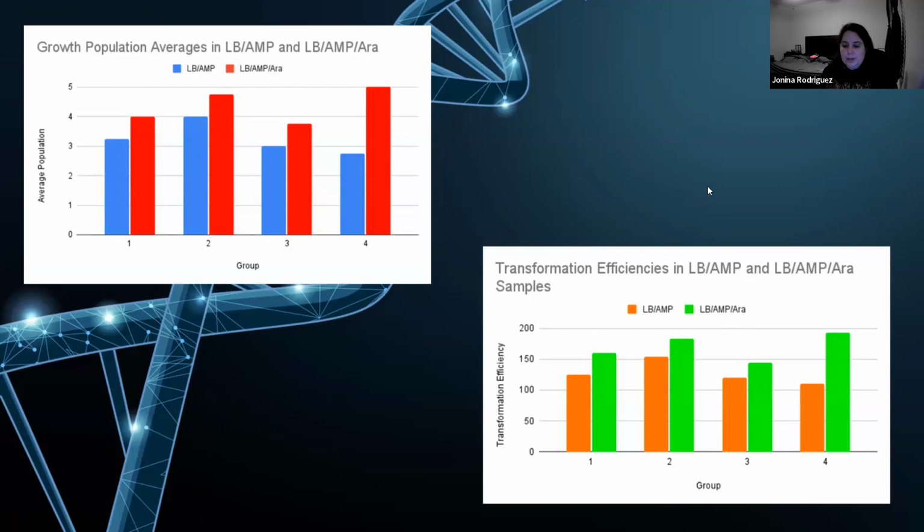So I really enjoyed doing this one because it was very interesting to see how bacteria develops within certain parameters, such as having the pGLO or having the ampicillin and the arabinose in them. I would definitely love to do more of this technique in the future, just because it was one of my favorite things to do. It's really interesting to see how this is done, and see the total procedure go full out for the 48 hours and then come back to it and see that we had bacterial growth.